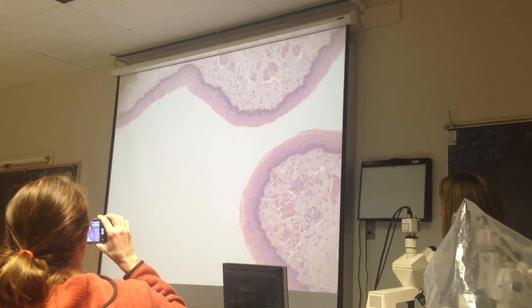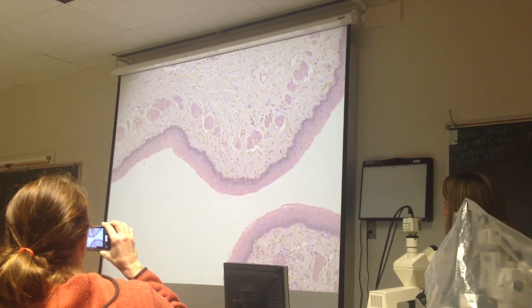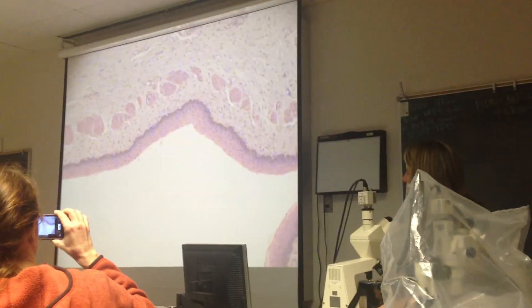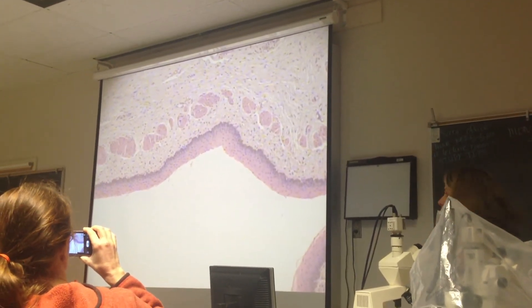This kind of epithelia has got lots of layers. It's for protection. This is the stratified squamous. Is it the keratinized or the non-keratinized? Non-keratinized. This is the non-keratinized.